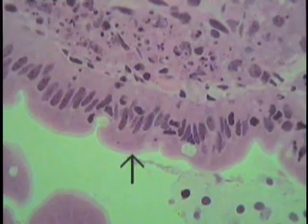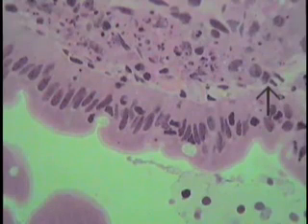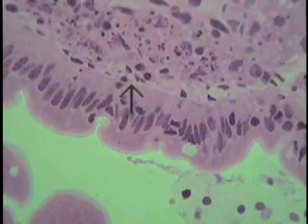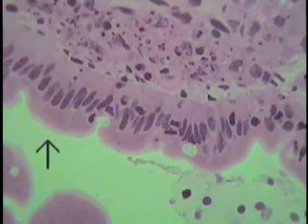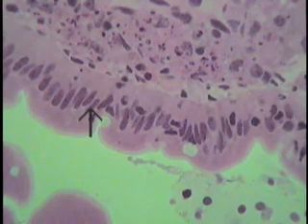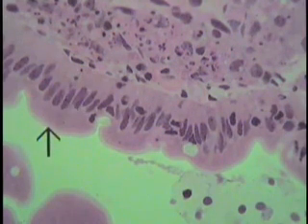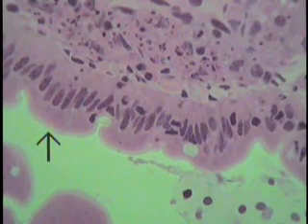The epithelial layer extends from here to here. Though a basement membrane isn't visible on this particular section, it should be residing or lying right about this location. These are the nuclei of this epithelial layer. So these cells are extraordinarily thin but yet tall columnar, the base of this cell being here, its nucleus, and then its apical extent all the way to the lumen.